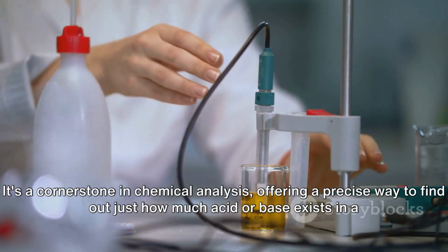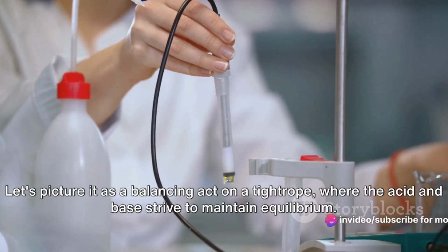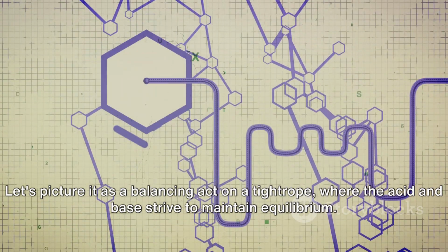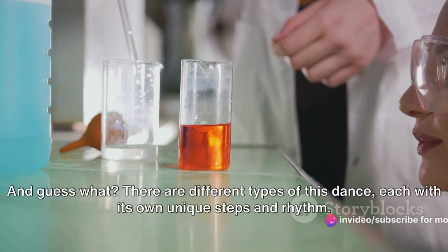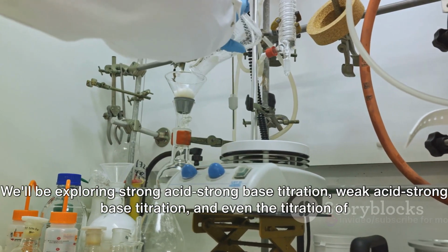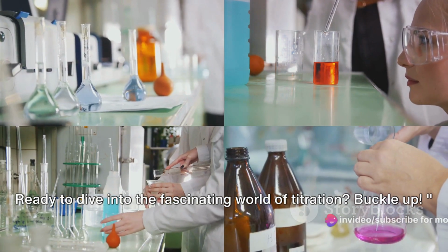It's a cornerstone in chemical analysis, offering a precise way to find out just how much acid or base exists in a particular solution. Let's picture it as a balancing act on a tightrope, where the acid and base strive to maintain equilibrium. And guess what? There are different types of this dance, each with its own unique steps and rhythm. We'll be exploring strong acid-strong base titration, weak acid-strong base titration, and even the titration of polyfunctional acids and bases. Ready to dive into the fascinating world of titration?